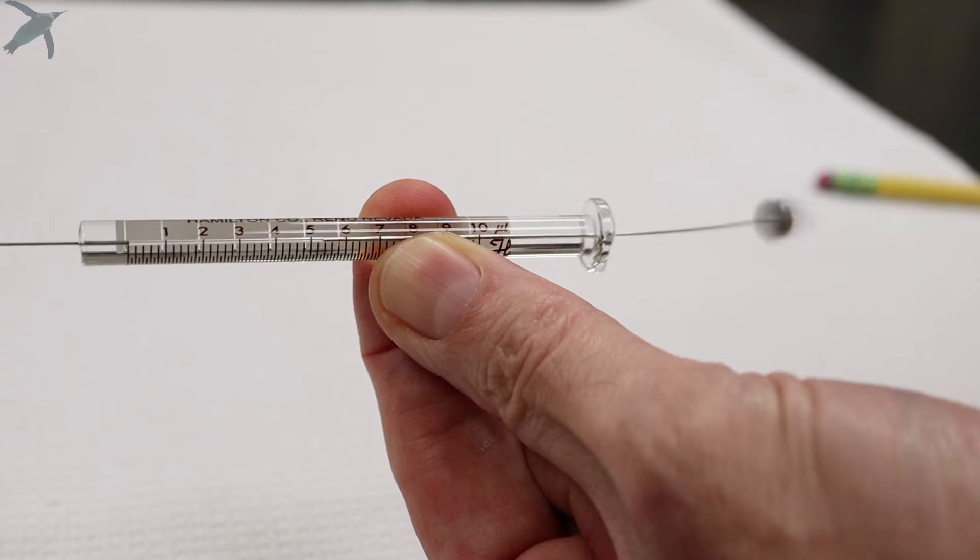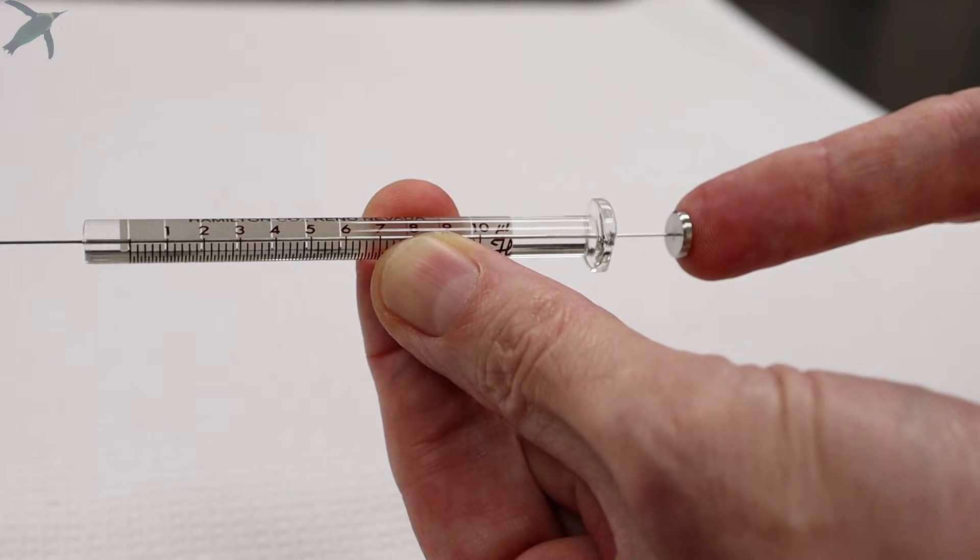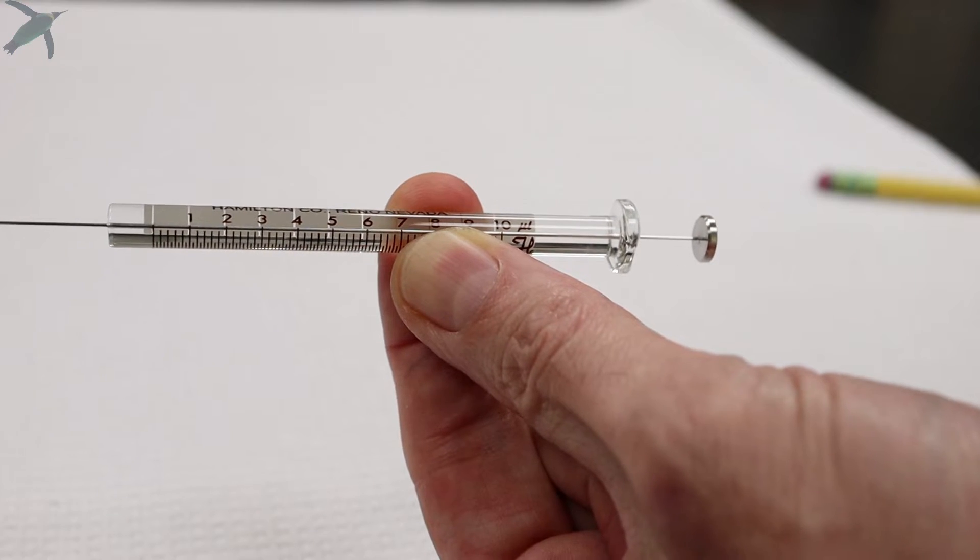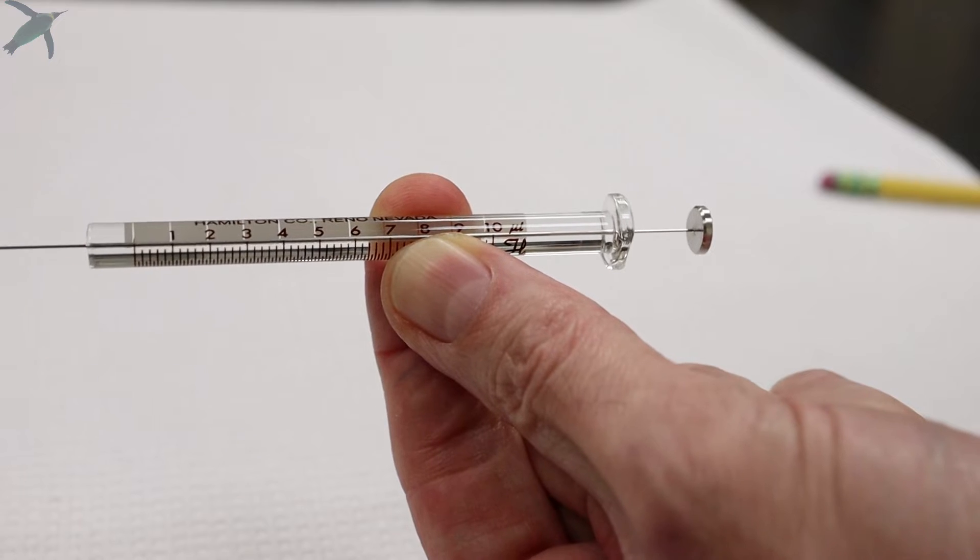Notice how thin and delicate the plunger is, so be careful not to apply too much force. Otherwise you will bend the plunger, and once it's bent it will never be straight ever again and you throw out the whole syringe.